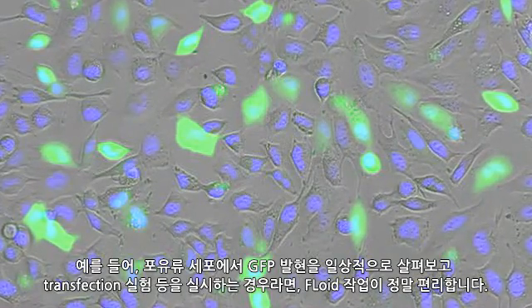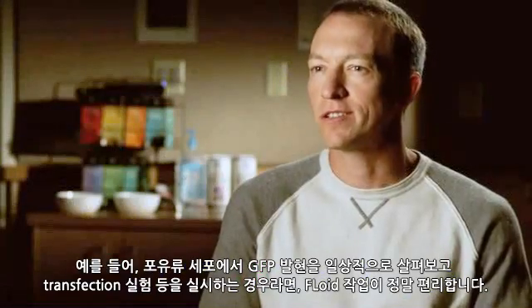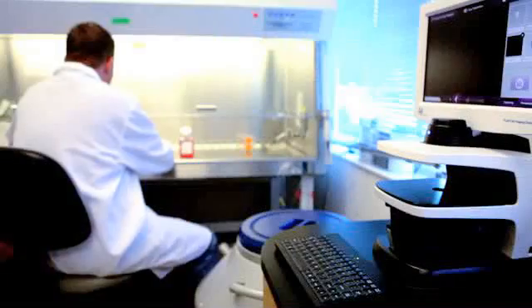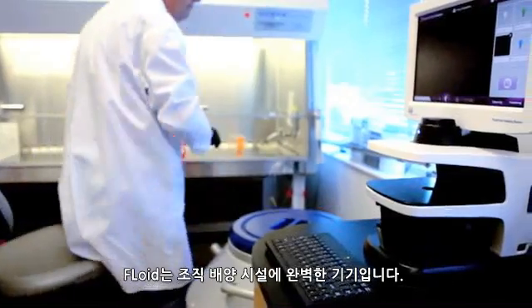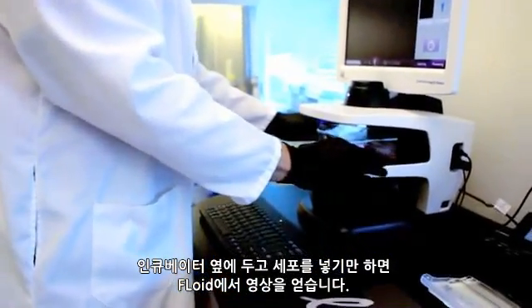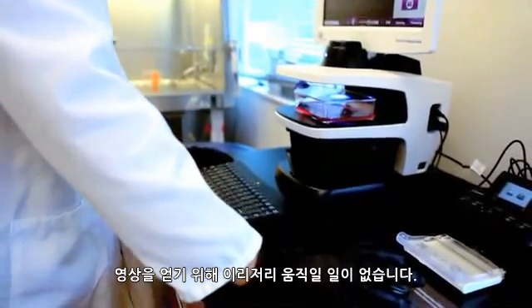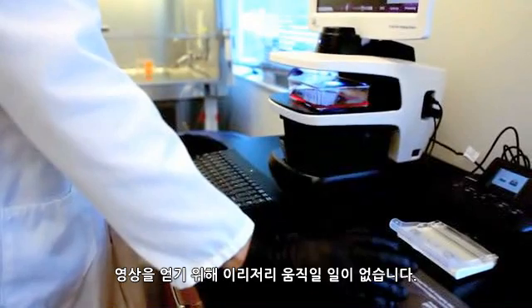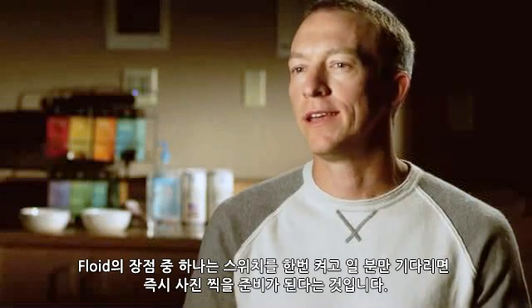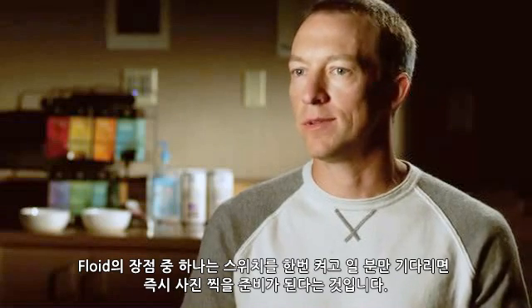FLoid works really well if you're routinely looking at GFP expression in mammalian cells doing transfection experiments, for example. FLoid is perfect for a tissue culture facility where people put it right next to the incubator — pop out their cells, take their image on FLoid, and they're right back in the incubator without having to walk down the hall. One of the beauties of FLoid is that you just flip a single switch, wait about a minute, and you're instantly ready to image.